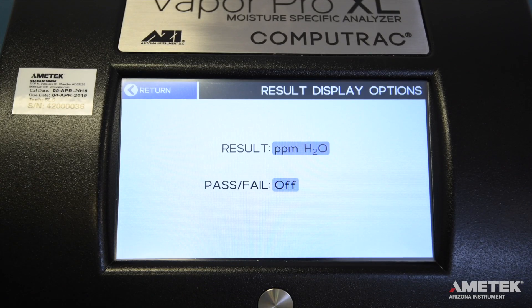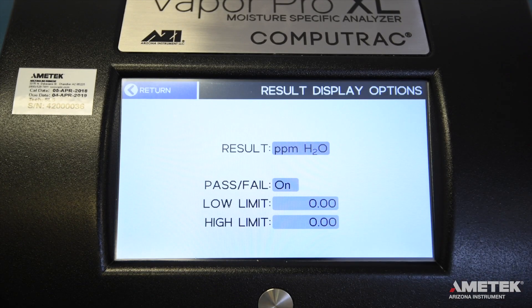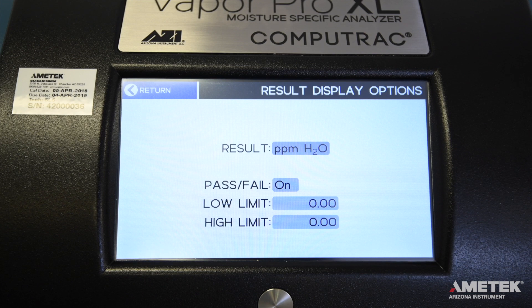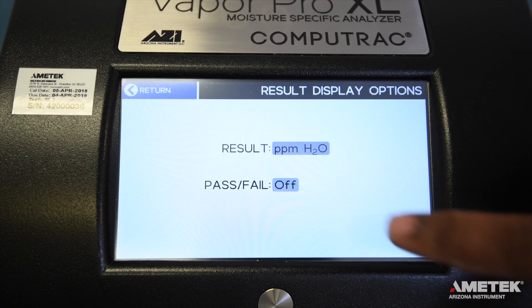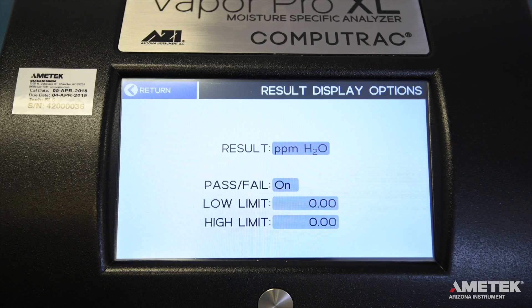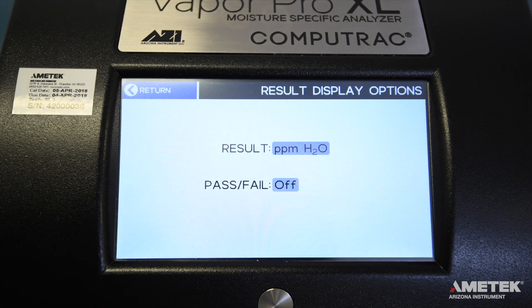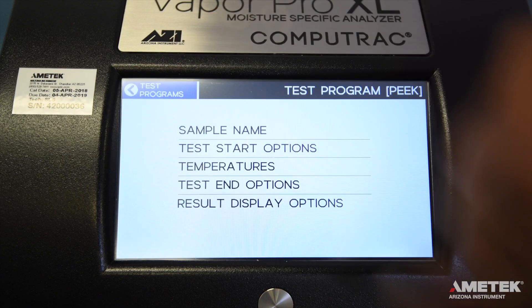The other field on the Result Display Options screen is the Pass-Fail option. When enabled, the result is compared to the manually selected High and Low limits. If your result is within the limits, the screen will turn green; if it falls outside of those limits, it will turn red. The Test Results List also indicates Pass or Fail by using green or red text for the result. To use the Pass-Fail feature, tap it and enter High and Low limits. If you do not wish to use this feature, simply leave the Pass-Fail option marked Off and press Return to go back to the previous screen.